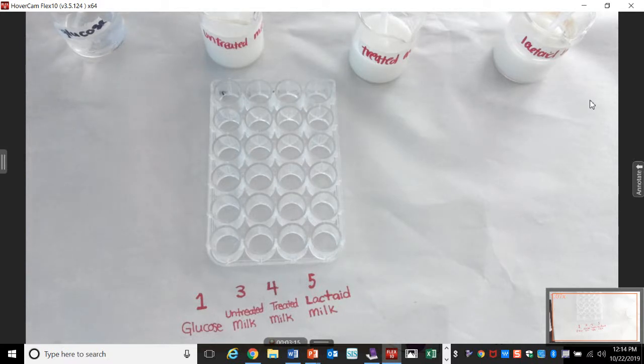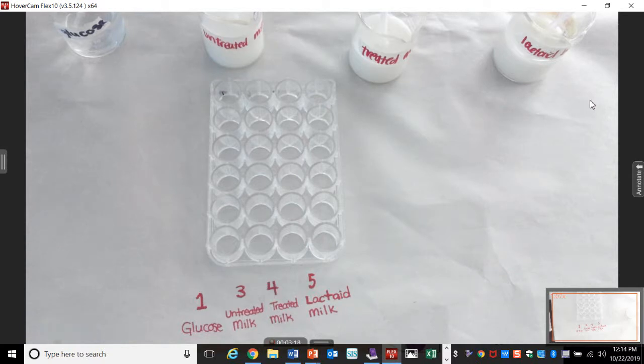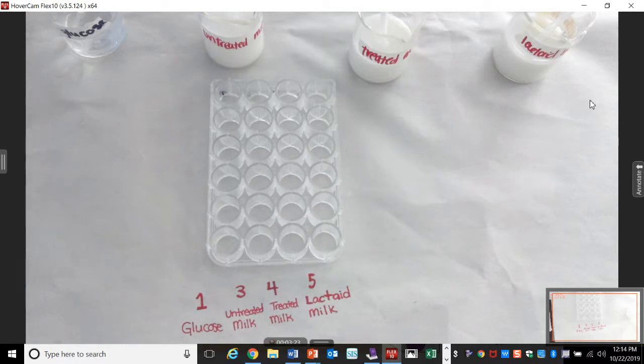So prediction time. Obviously, if we test glucose, it should be positive, right? Now, we've already done a glucose test. Remember the starch glucose protein test? We'll use Benedict's. This time we're going to use a glucose test strip.